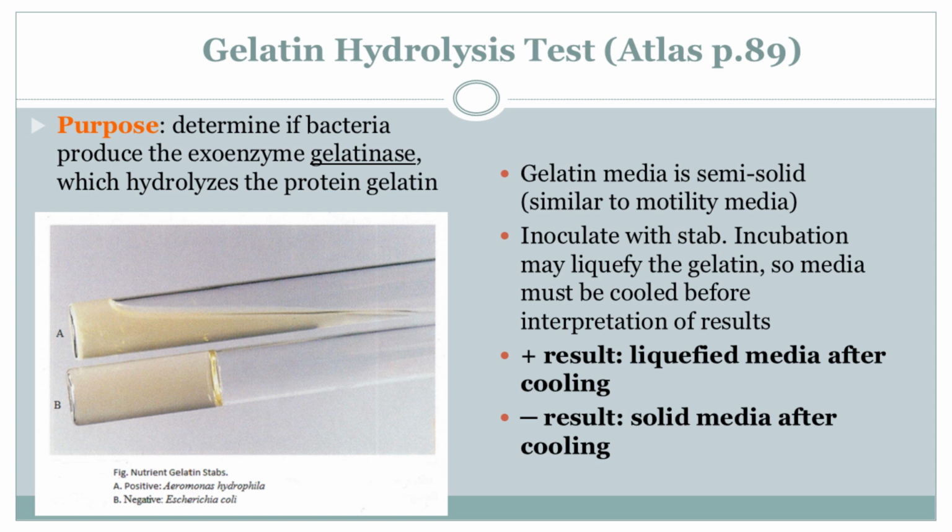So it's like a science experiment and a magic trick all in one, with the disappearing gelatin. You could say that. Yeah. And the enzyme that makes this disappearing act happen is called gelatinase. Gelatinase. So that's their secret weapon, the thing that lets those bacteria break down the gelatin. That's it. And whether or not this enzyme is there tells us so much about the type of bacteria we're looking at. So it's like their bacterial fingerprint. If they've got gelatinase, we know they're a certain type of bacteria.